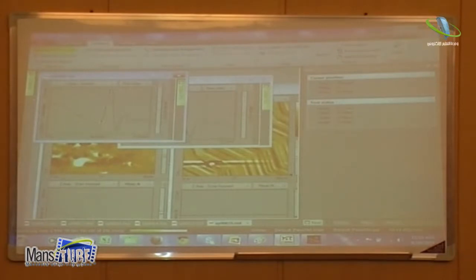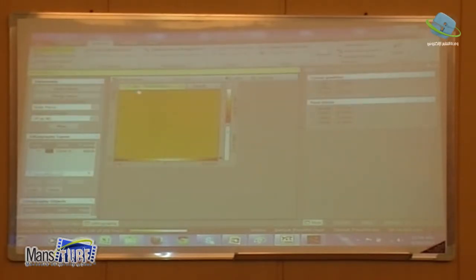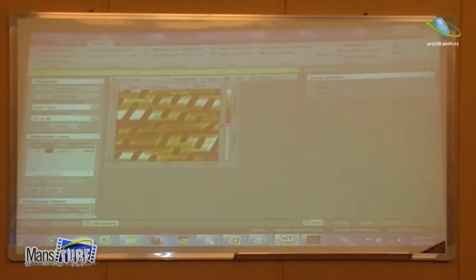Okay, so what I will do now, we can go again to the lithography. I will make a load, sorry. It's not a big deal, really. This is not a big problem. This is the image, okay? But I think that was unlocked here.